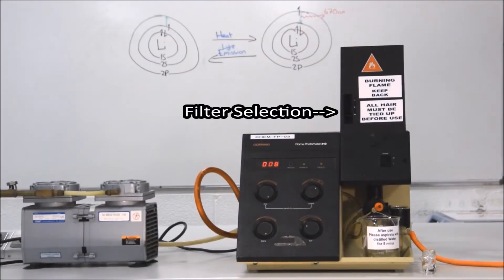The first thing we need to do is decide what particular element we're going to measure. This particular model has three filters: sodium, potassium and lithium, and we can select the one that we want to use. In our case, sodium.